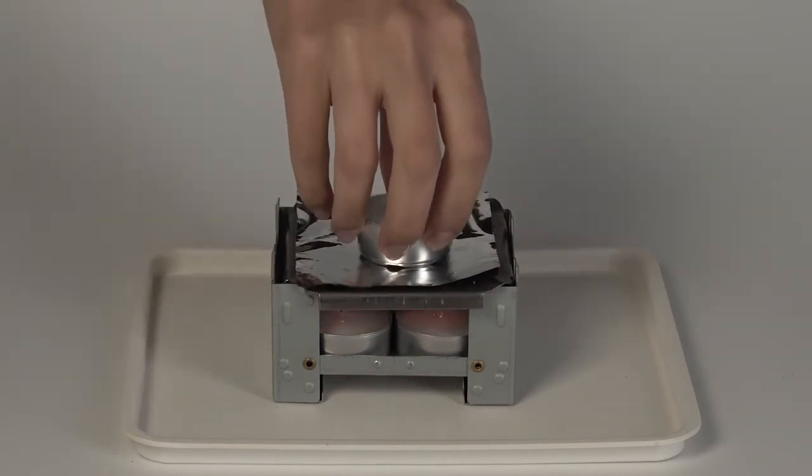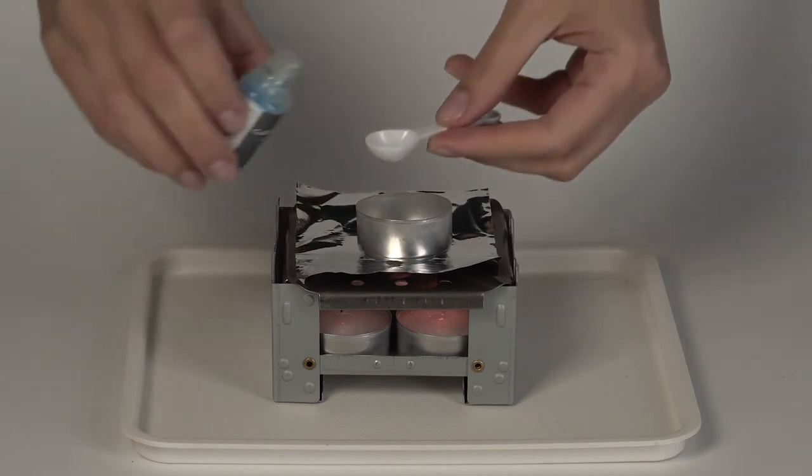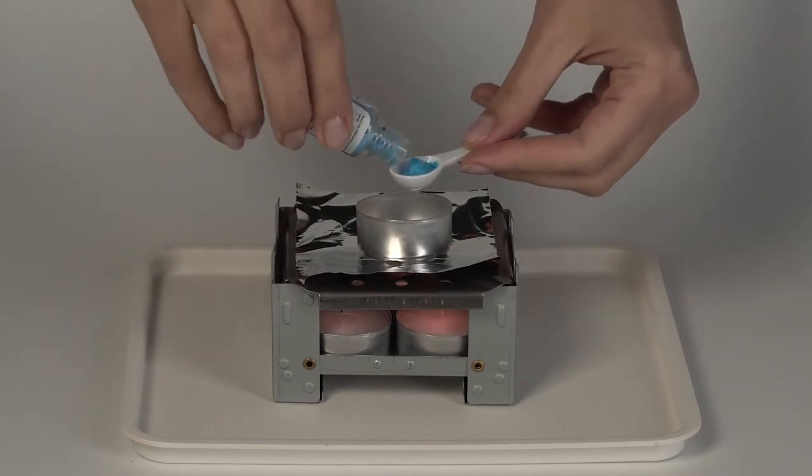Set an empty mold on top of the foil. Pour one big spoonful of copper sulfate into the mold.